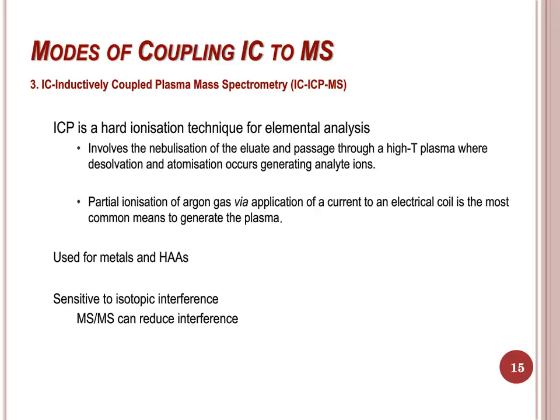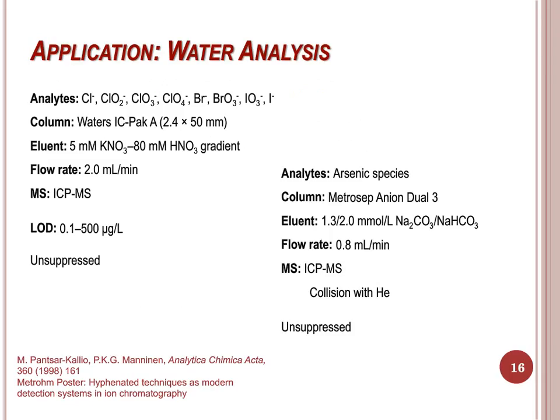Work published on trace ion exchange ICP-MS involves the use of low carbon containing eluents, and the use of carbonate-bicarbonate eluents without suppression has been shown to decrease sensitivity in ICP-MS through contamination of skimmer cones. On the other hand, the use of eluents such as nitric acid, ammonium nitrate, or ammonium hydrogen phosphate generally have not required a suppressor and could be coupled directly whilst maintaining sensitivity at the nanogram to picogram level.